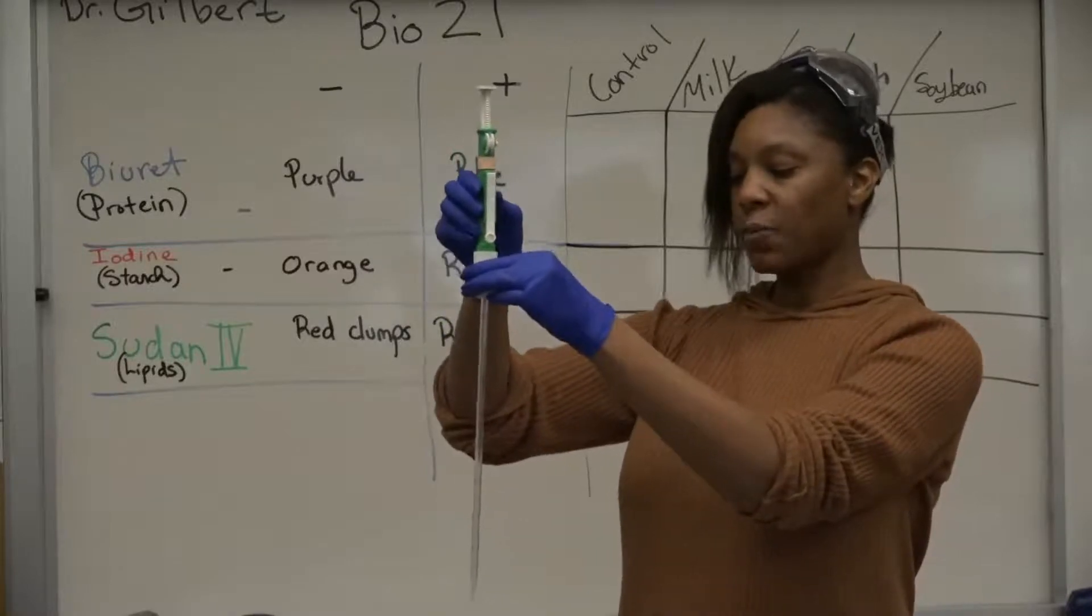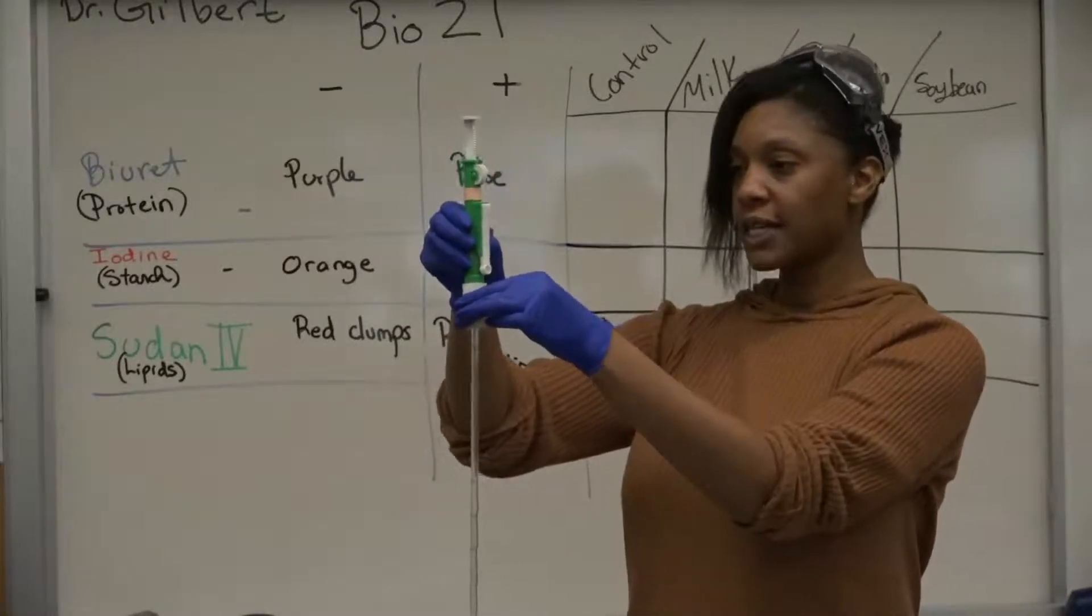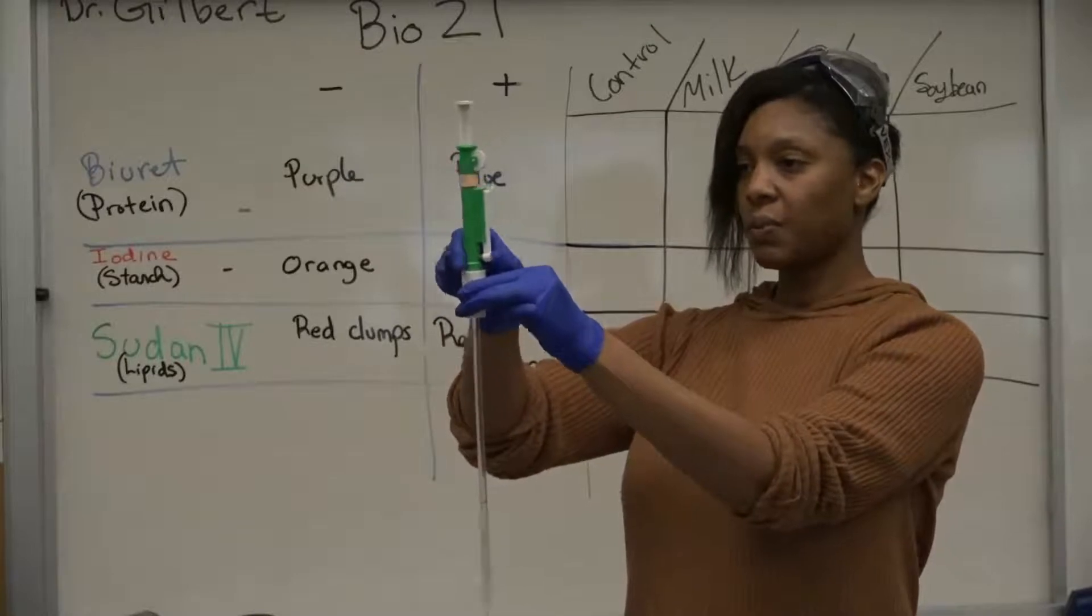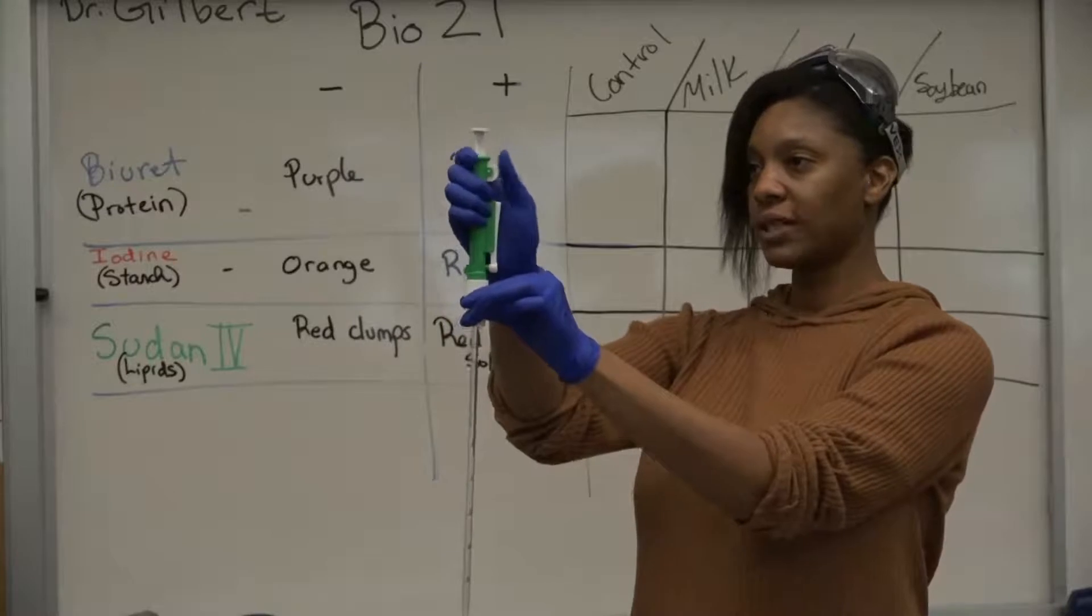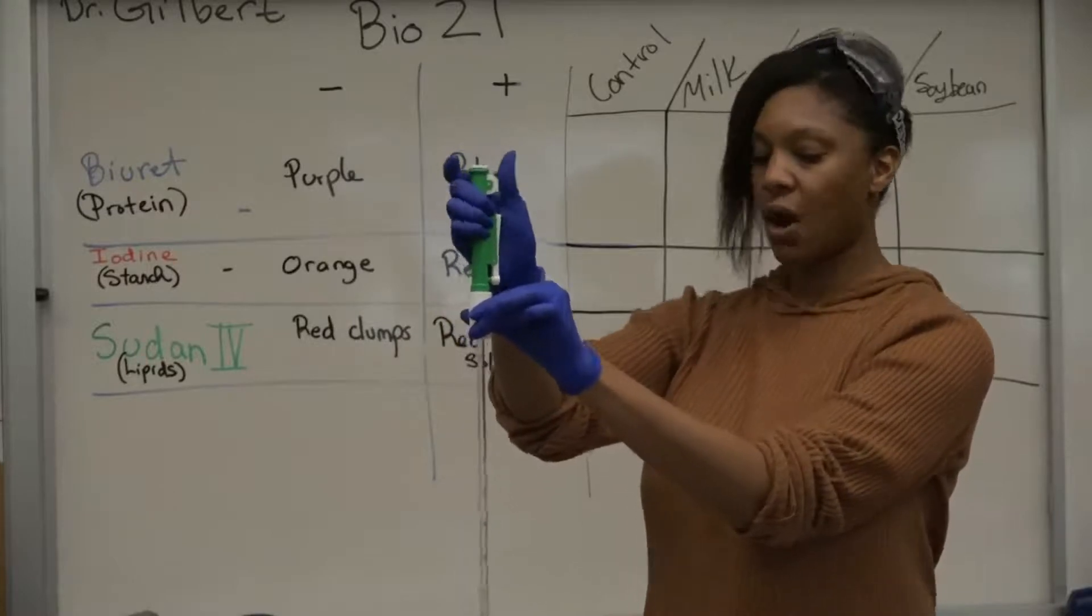Once you get it in your pipette, you can move it to where you want to disperse it. And then you can just press this cute little button here, and it'll drop back. And I'll show you what this looks like with our milk that's here.